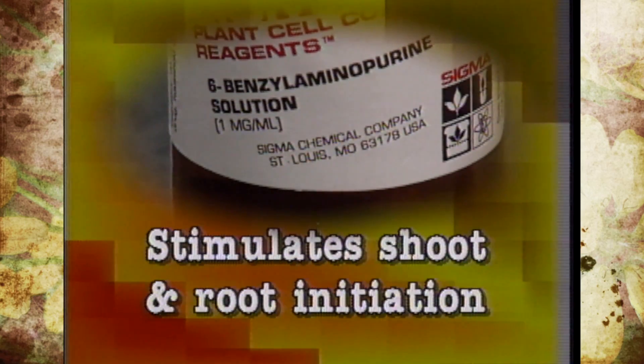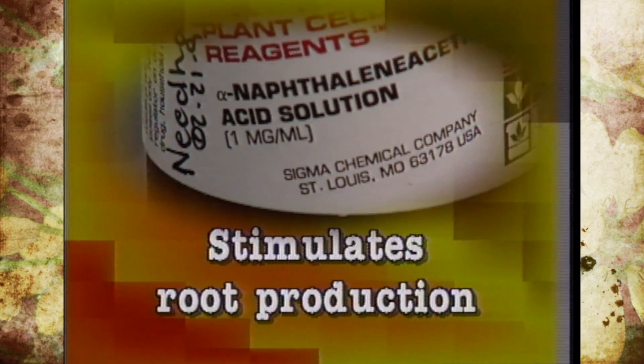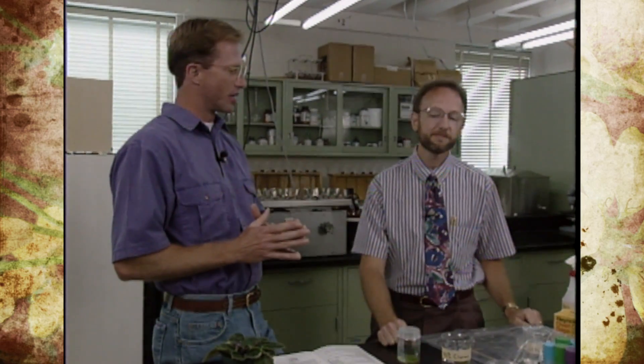There are also hormones to stimulate either root and/or shoot initiation. We use benzyl adenine as the cytokinin source that stimulates shoot initiation, and NAA — naphthalene acetic acid — as an auxin source that stimulates root production. A lot of the research involves determining the exact amounts of those various components.